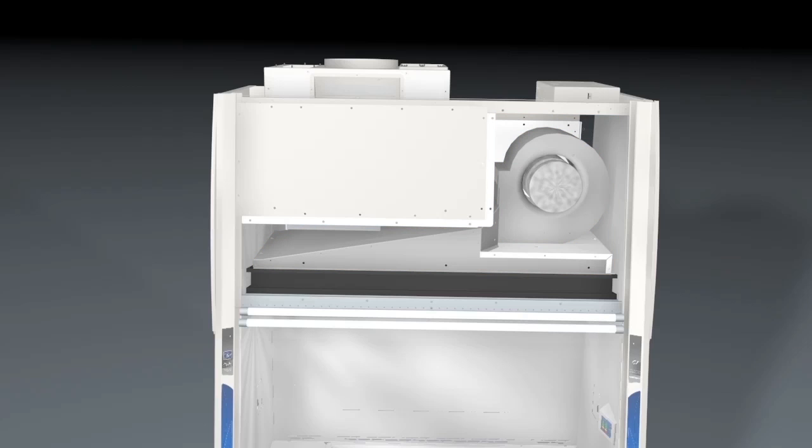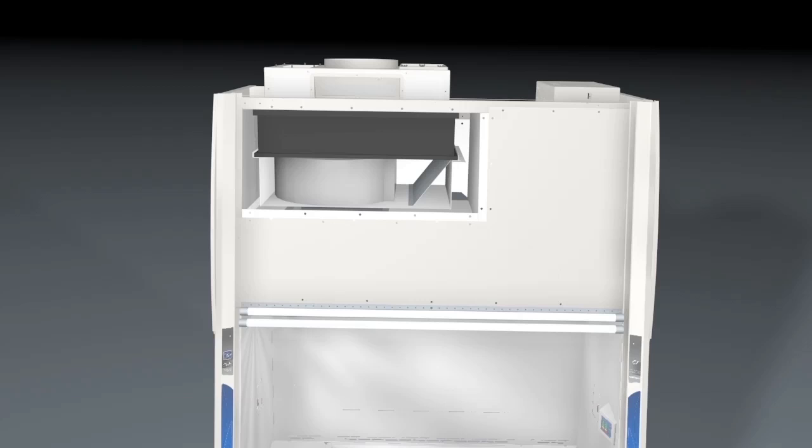The Axiom's exhaust has a combined ECM-driven blower and plenum and an exhaust HEPA or ULPA filter.